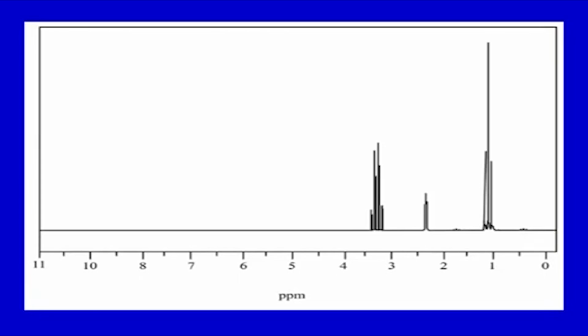Signals in the 1H NMR spectrum do not necessarily appear as a single line, because there is a splitting pattern, as we have seen in here, and this gives information as to how many hydrogens are present on the neighboring carbon. So, depending on the split, it will tell about the number of hydrogens, and also integration of the 1H NMR signal allows the number of hydrogens in each environment to be determined. If you see in this figure, the splitting of the peaks occurs depending on how many hydrogens there are, and that is determined by the number of atoms attached to a particular group.